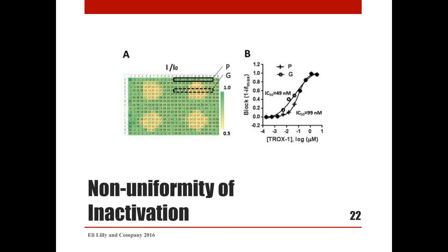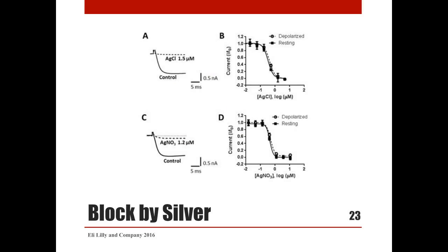Although initial experiments indicated good stability of recordings over time, we wanted to assess the stability of currents at partially inactivated voltages in more detail. We calculated the block produced by addition of buffer during the depolarized holding potential. The heat map of fractional current showed four areas of the patch plate where currents were substantially reduced. These areas coincided with the location of four ground electrodes situated underneath the patch plate, and the impact of such non-uniformity on concentration-response curves for verapamil is illustrated.